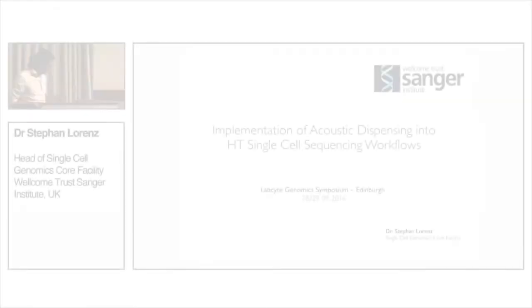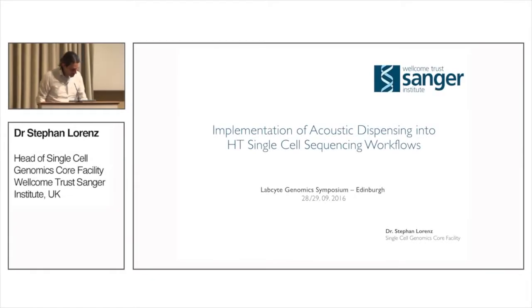So let's get started. In this talk, I'll show examples of how one can implement acoustic dispensing into high-throughput single-cell genomics or single-cell sequencing workflows.